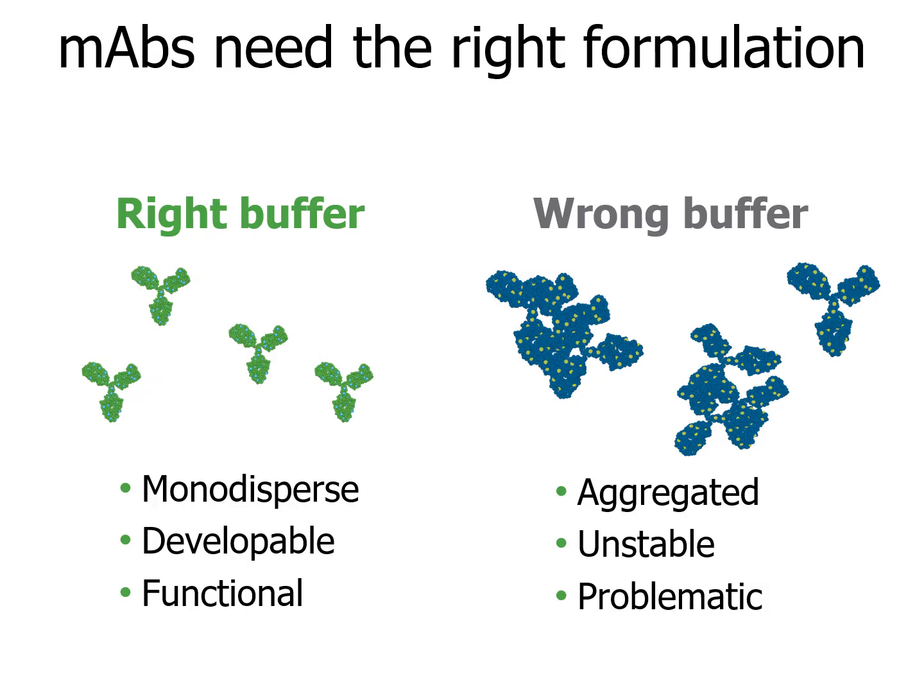to keep things functional. When antibodies are in the wrong formulation buffer, this leads to more self-interaction and the formation of aggregates. Aggregates lead to issues including decreased stability of your molecule and rejection for use as a therapeutic, as they may lead to an immunogenic response after administration.